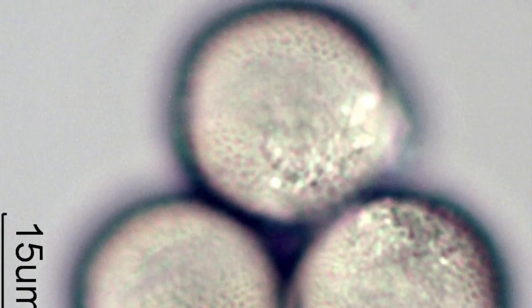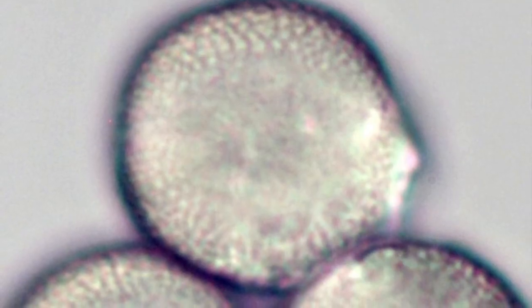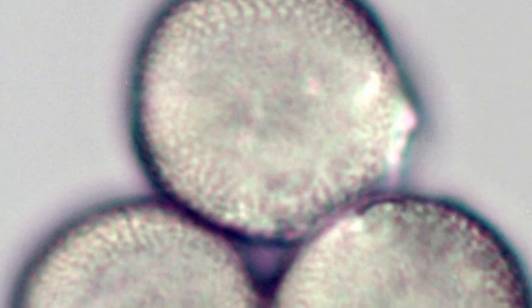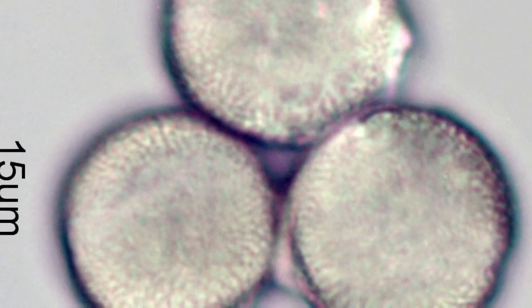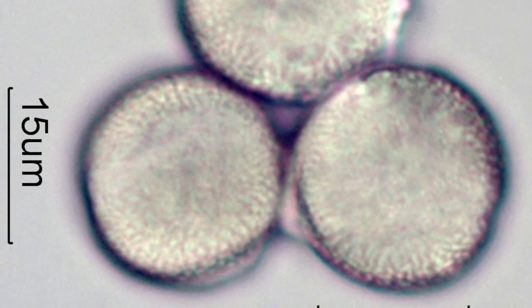We can tell by the fact that their order, their position, is somewhat random. As we focus a little deeper, we can see that the reticulum continues around the grains. The reticulate structure is the same as we go around the entire grain. We can see still we're getting a circular cross-section.